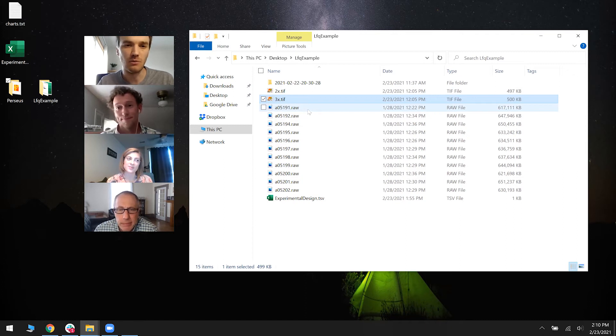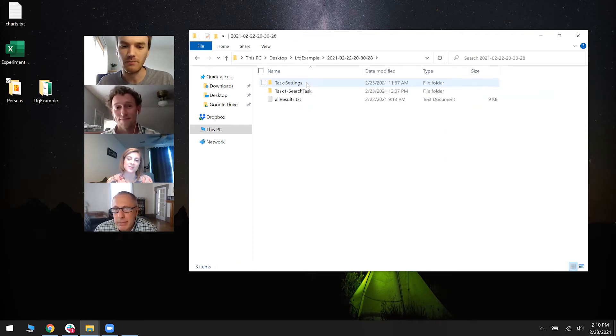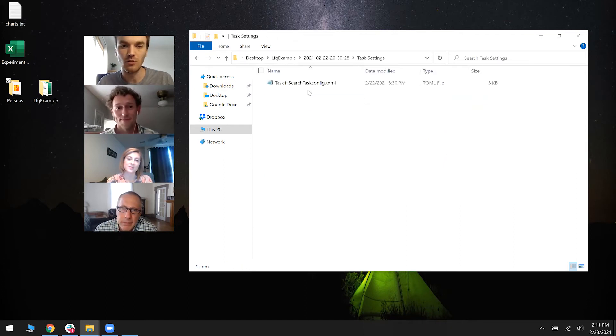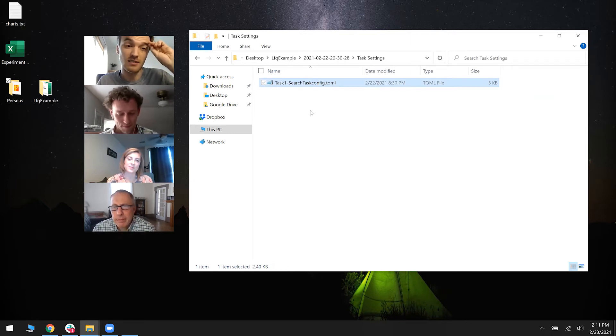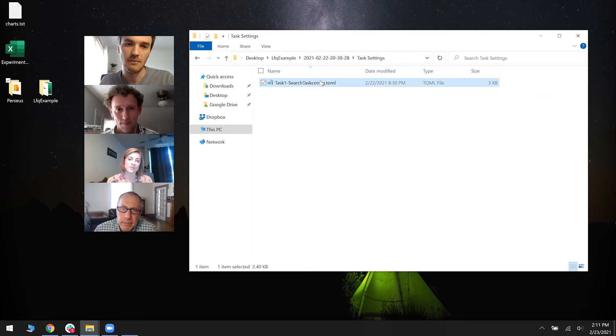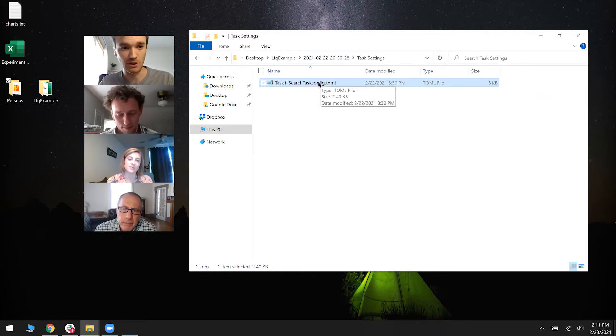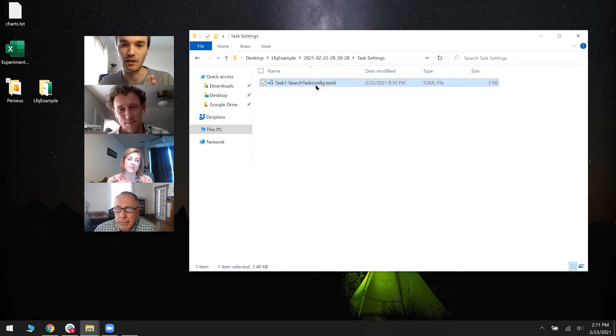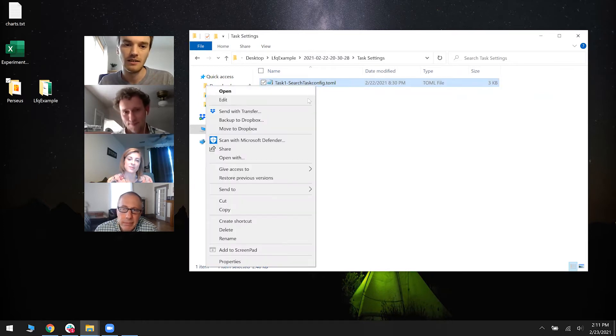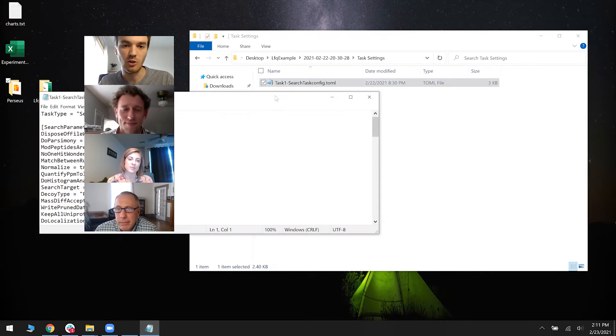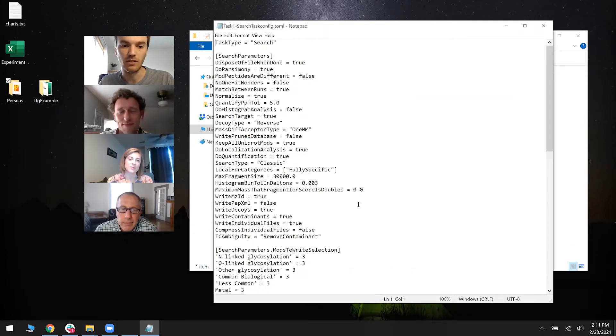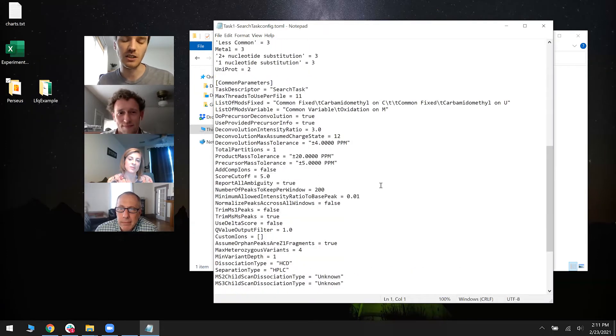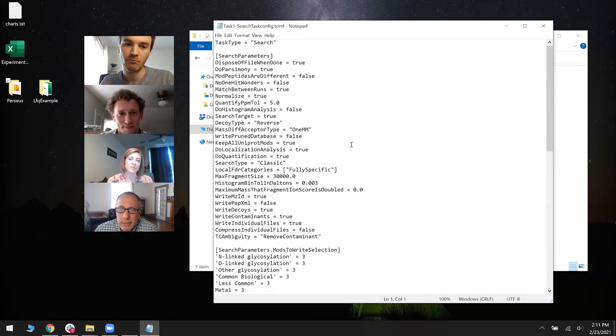So I'll talk for a second about TOMLs. This is a TOML for a task that I ran last night. The TOML file isn't really like some esoteric mysterious file format. It's actually just a text file. You can open it in Notepad and read what these different settings are that we use. There's a lot of them.